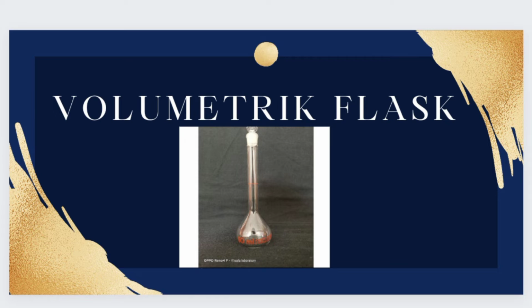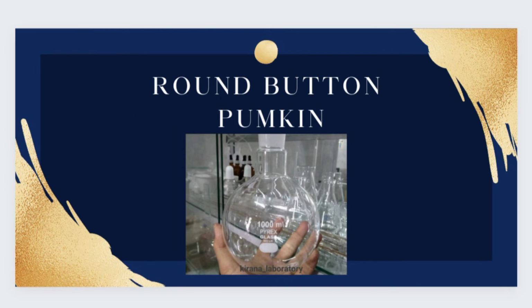In the dilution system, the solution is filled until it reaches the mark on the neck of the flask. Furthermore, there is a round bottom flask that can withstand higher temperature. This glass tool is commonly used for the preparation of bacteriology culture media.